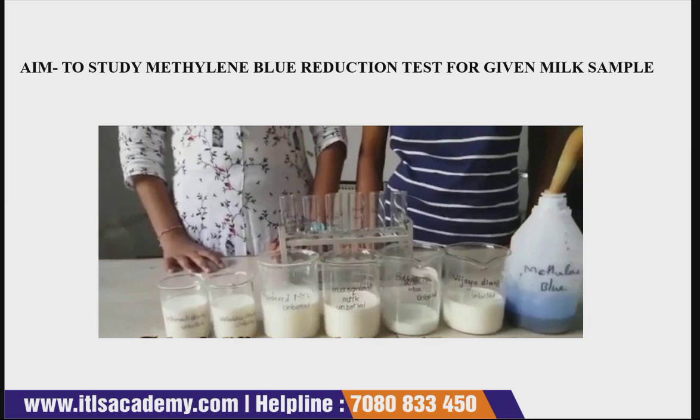If the milk cans are not properly cleaned, not washed properly, not properly sanitized, then there are huge chances of microbial contamination. And also the milking machine. So one of the popular tools for the determination of milk quality is the methylene blue reductase test. The methylene blue reduction test is basically used to determine the quality of the milk sample.